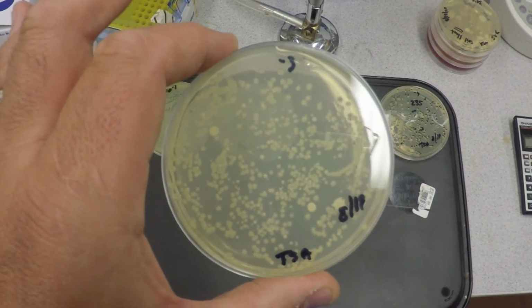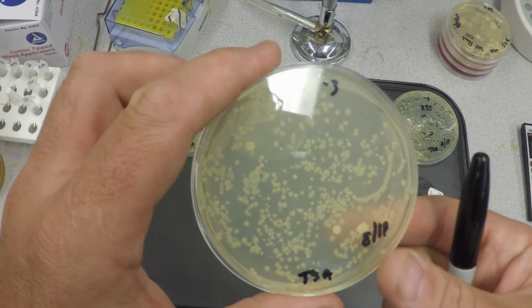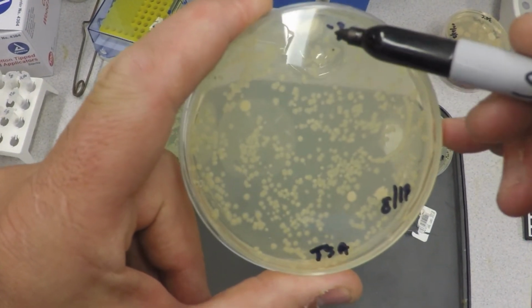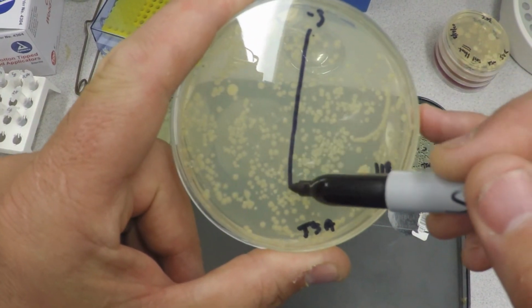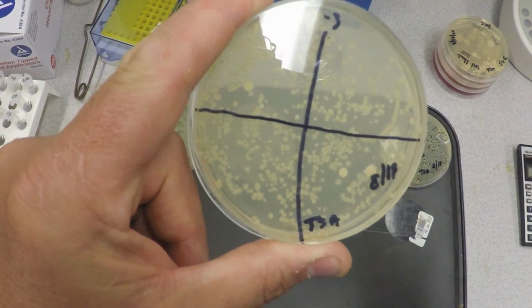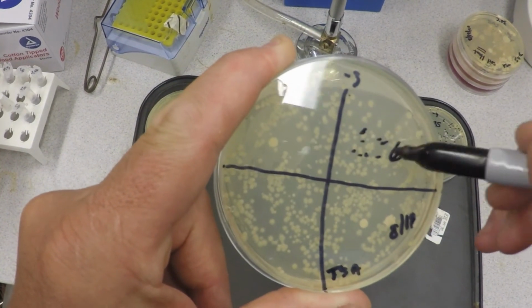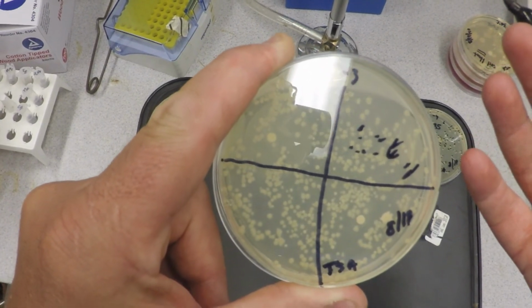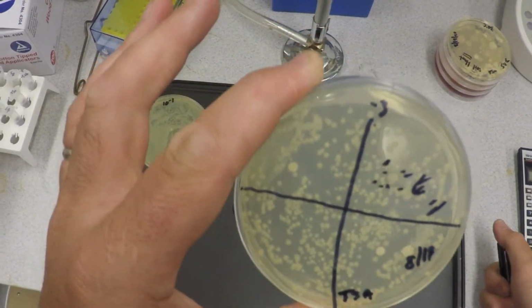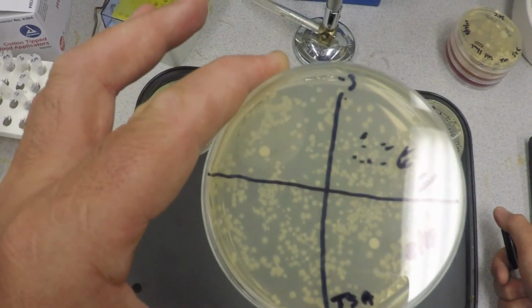And if there was a situation where you didn't have anything else that was countable and this was all you had, what you could do, which is kind of illegal, but why not, is split this into quadrants, say split it into 4, approximately equal, and count the colonies in one quadrant and multiply by 4. Okay, that's really not legal, but it would give you at least an estimation. Then you'd put in your lab book or your report that this is a gross estimate, and here's why.